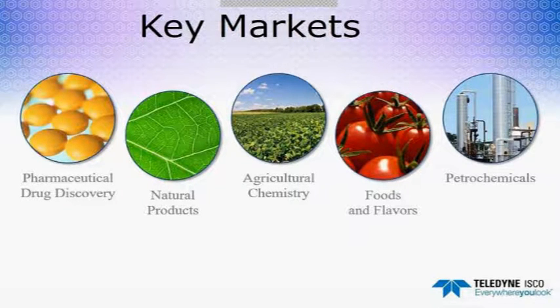The selectivity of a column, I don't know how to predict it a priori. However, what I can do is run a TLC plate and compare whether I get an increase or decrease in resolution. And with an increase in resolution, that allows me a larger sample load.